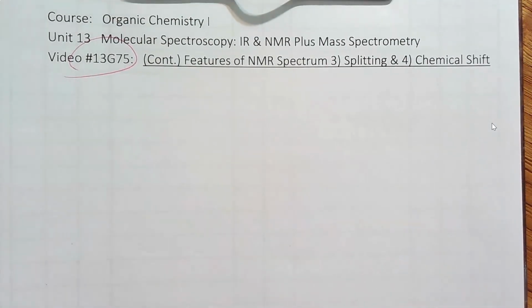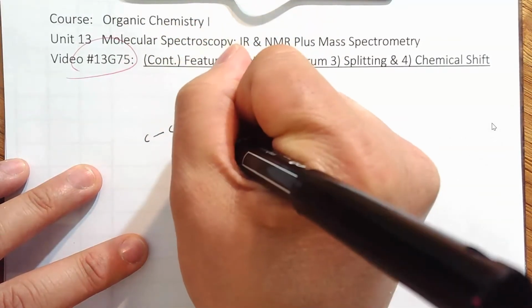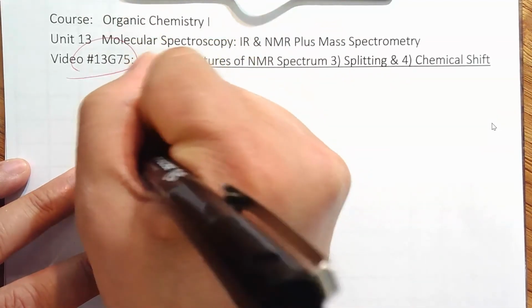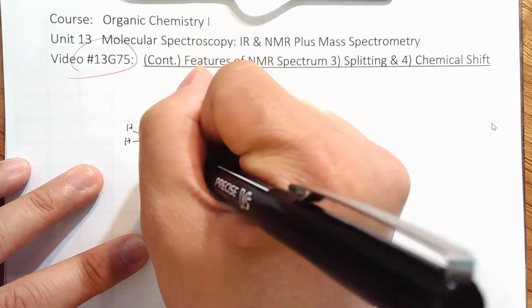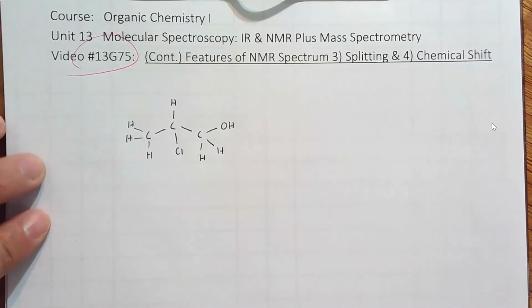But where does that come from? Why was my signal split? Okay, let's take a look at a molecule, and I'll draw out all the hydrogens. I want to do this properly. Okay. We'll put 3 hydrogens here. And 1 hydrogen here for sure. And I'm going to put a chlorine here. Does that satisfy the octet for all carbons and oxygens? I think so. Okay. Let us label, like we did in the last video, the signals.